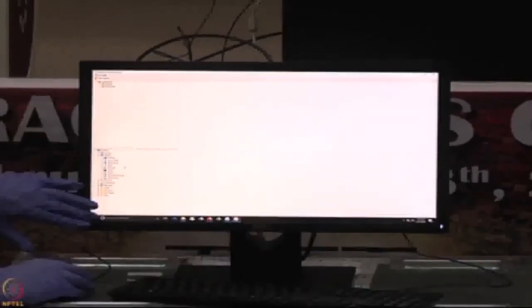Okay. Then on my left hand side, at the bottom, is where your data is stored. Here I have a folder called IIT demo. I will drop it down, then click on the kinetics. The experiment name I provided is kinetics. The pink color file here, I will double click on this. When I double click, automatically the kinetics data will be opened here, because I started the experiment in kinetics mode.